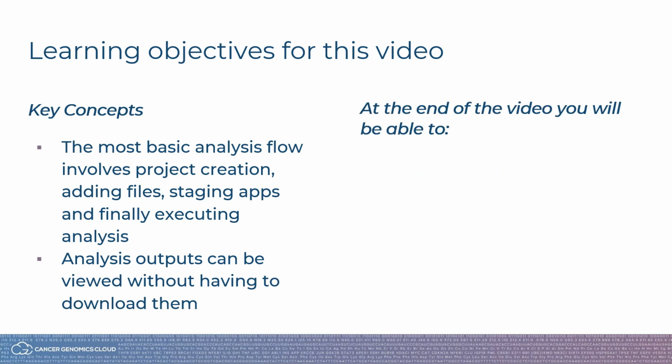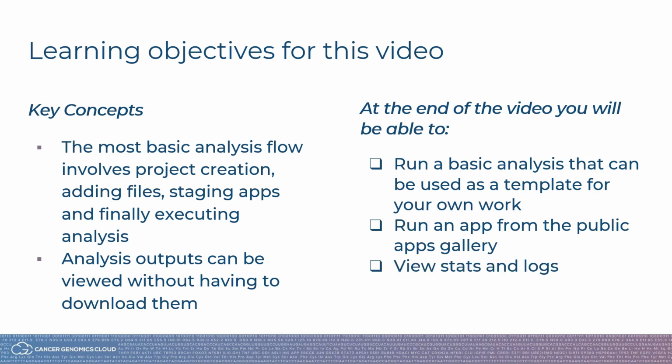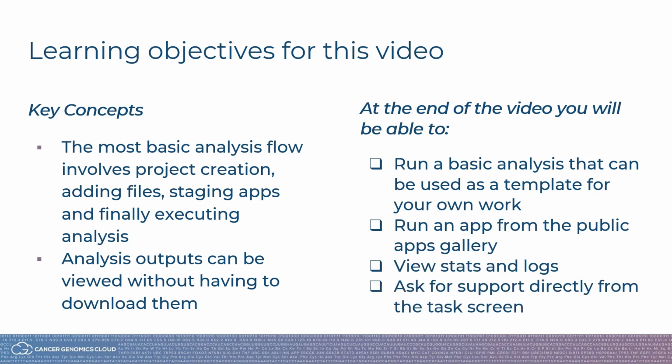At the end of this video, you should be able to run a basic analysis that can be used as a template for your own work, run an app from the public apps gallery, view stats and logs, and ask for support directly from the task screen.